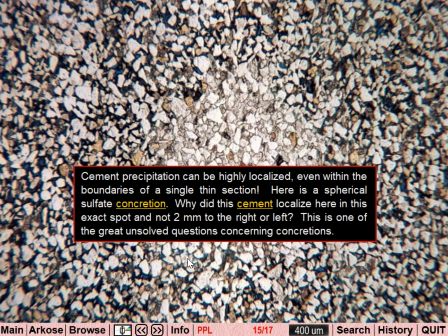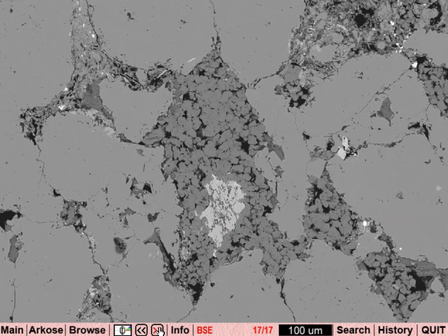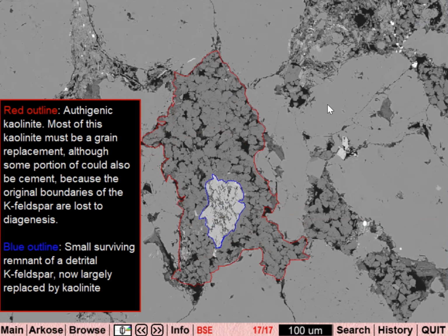Probably it's gypsum. However, I've seen barite cement as well. And this is a sandstone that used to have a great deal of oil. Okay, this is really a rock with a high proportion of quartz and a beautiful calcite cement. Here we go, we're closing in.